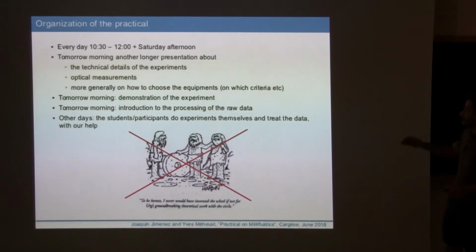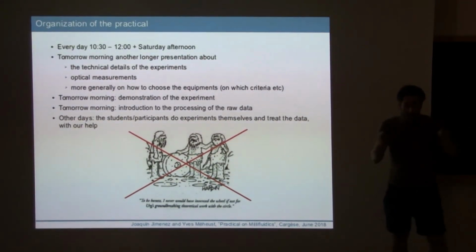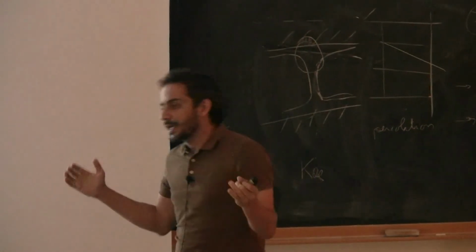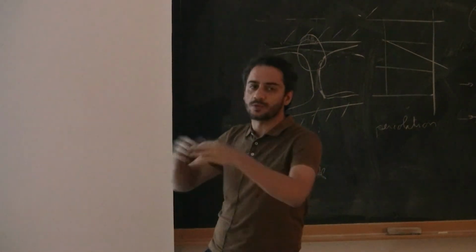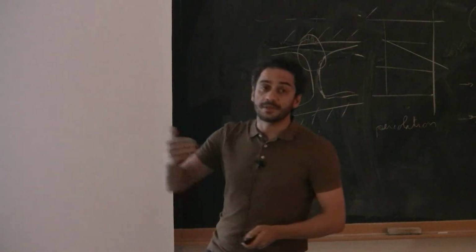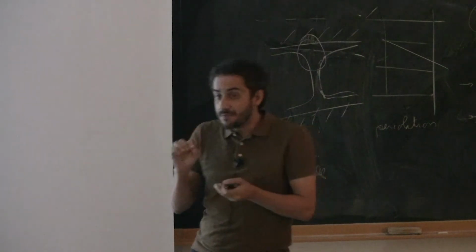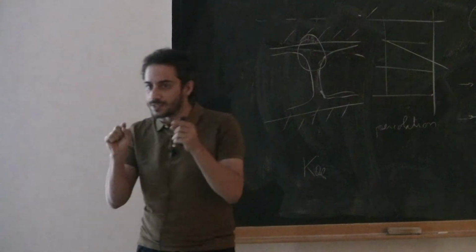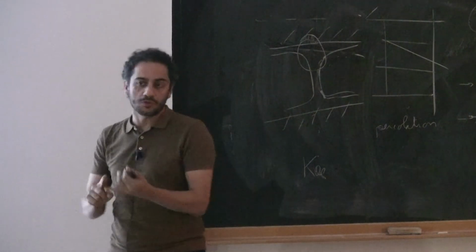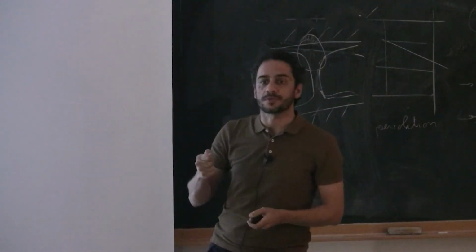Then, the day after, the idea is that you run your experiment by yourself with different flow rates, which means different Peclet numbers, or whatever you want. Pressure controller, imposed flow, whatever you want to do. And then post-process this data, and believe me, the script is very short. It's by yourself that you have to decide what you want to compute. Do you want to compute dispersion? Then you have to write how to get this information from the images.